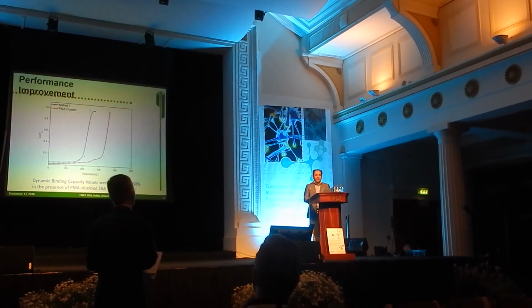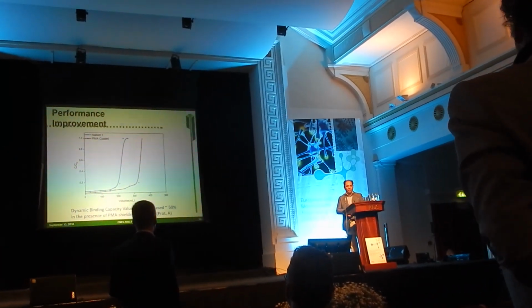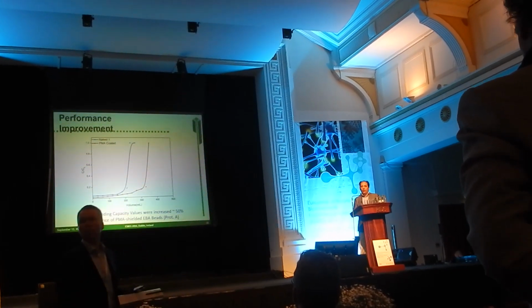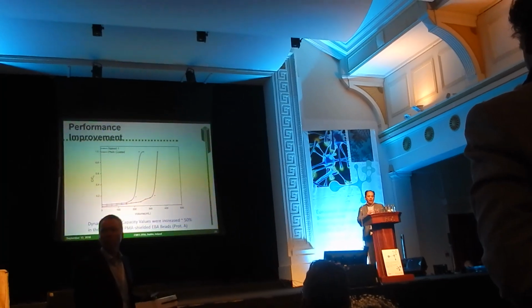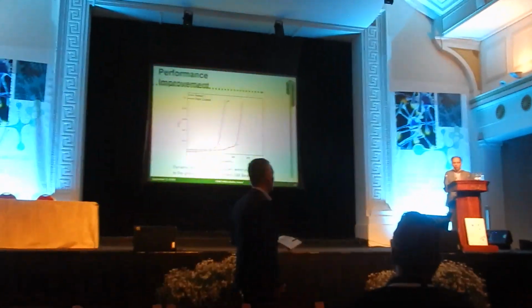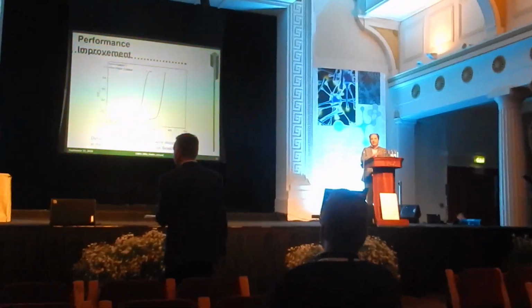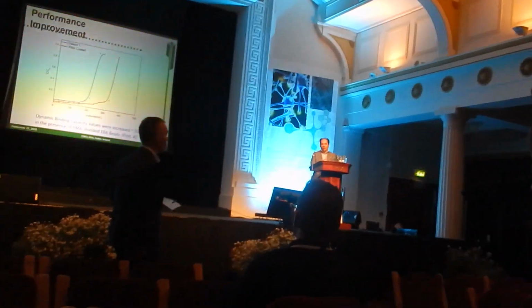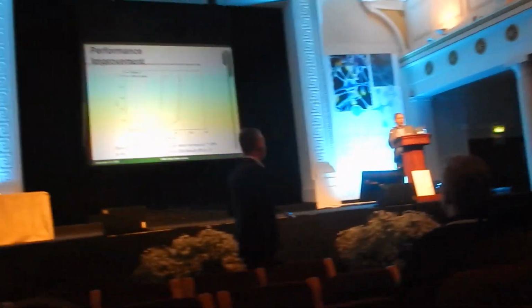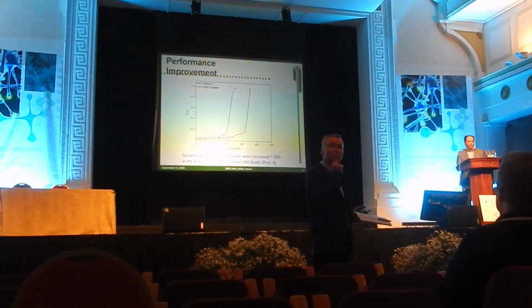Yes, well, this is the preliminary data. As you see, it's a very raw kind of picture that I'm showing here. In principle, I am not sure that by, so to say, shielding the bead with the polymer, we would necessarily block any kind of pores, right? Because if there is a physisorption of the polymer on the bead, for example, this polymer, if the molecular weight is not so big, would eventually enter also the pores and basically be on the surface of every pore, right?